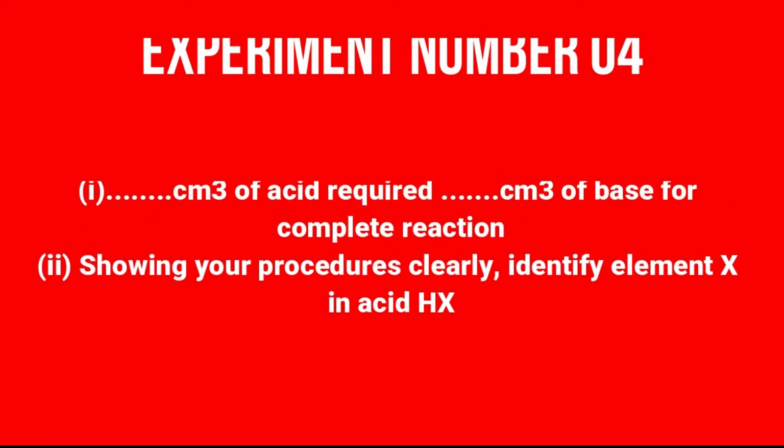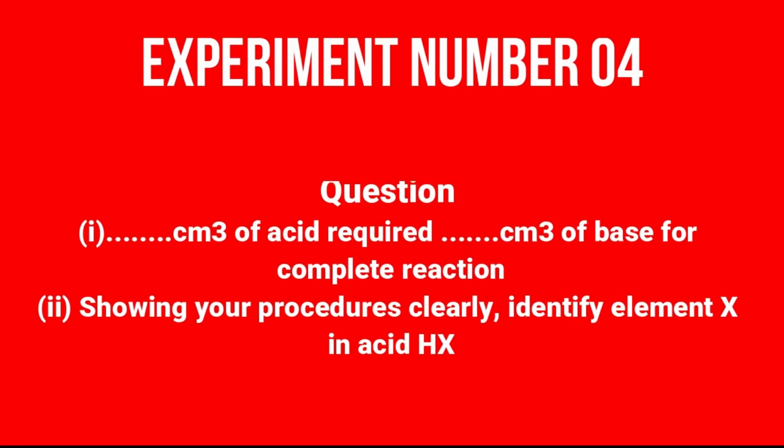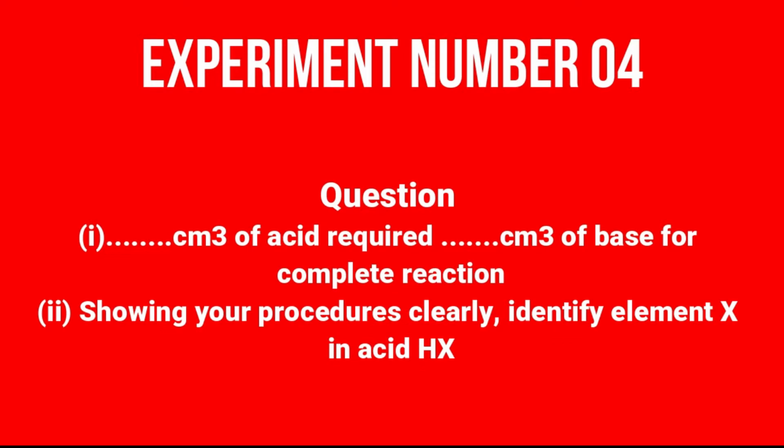Another question: what is the volume of acid required to neutralize the volume of base for complete reaction? That is a very important question. You are supposed to know, after titration, what volume of acid is required to neutralize the volume of base for complete reaction. So what is the volume of base and what is the volume of acid?